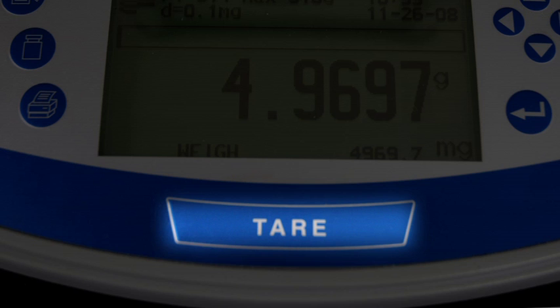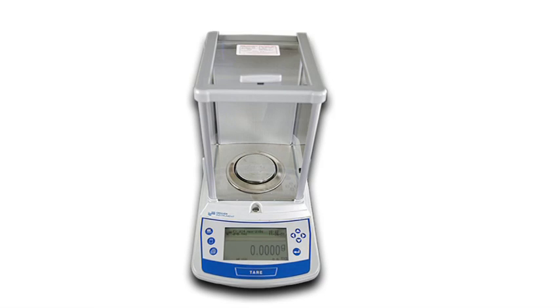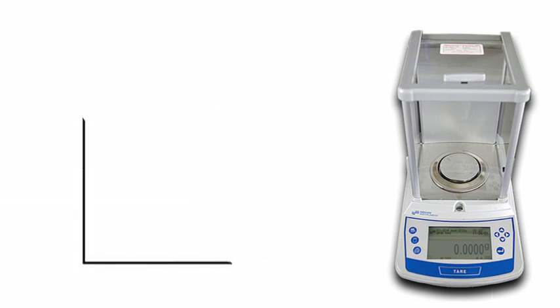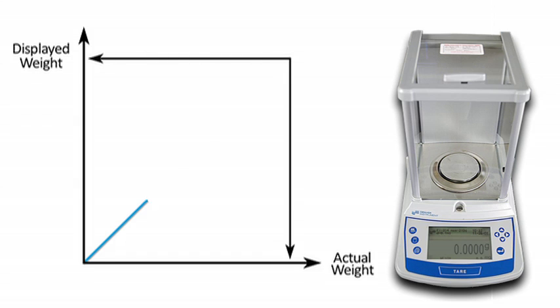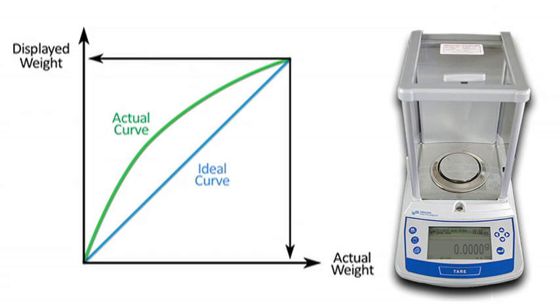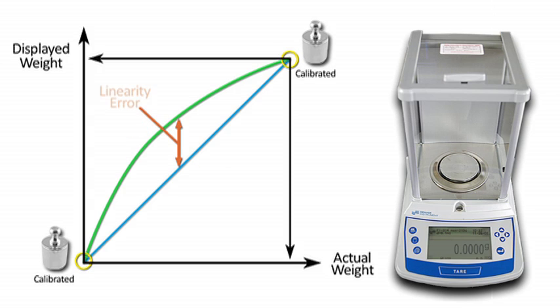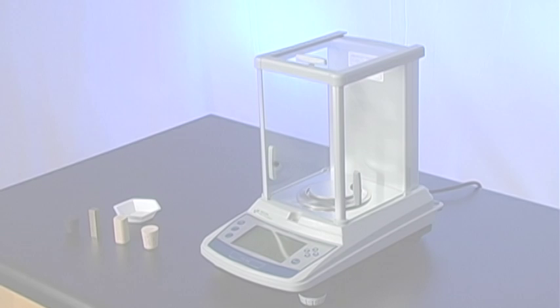In today's experiment, we will be checking the linearity of the balance by testing its response at its midpoint. Linearity error occurs when a balance is properly calibrated at the bottom and top of its range, but its weight values in the middle are not correct. If a balance has a linearity error beyond the manufacturer's specifications, then it must be professionally repaired.